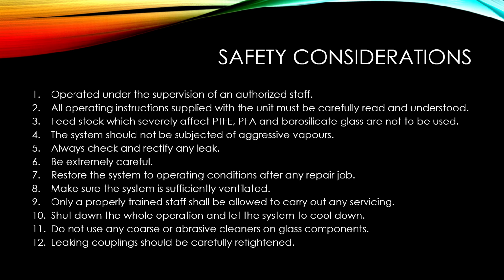After that, the system shall not be subjected to shock, sudden impact, vibration, additional load, or permanent external action of aggressive vapors. Always check and rectify any leak. Next, be extremely careful when handling hazardous, flammable, or polluting materials by wearing mask and gloves. Restore the system to operating condition after any repair job.